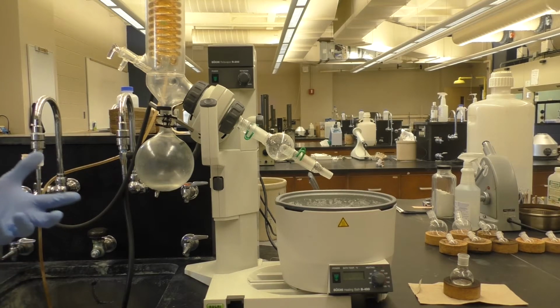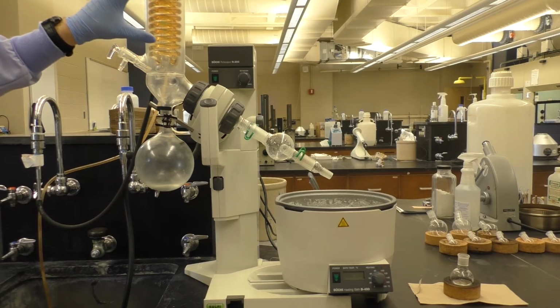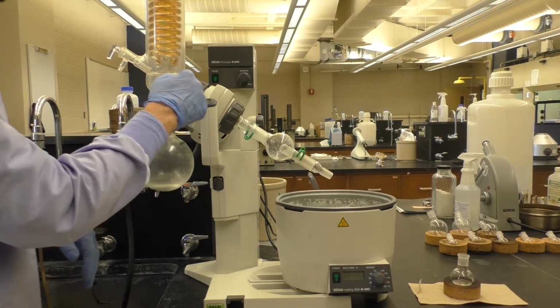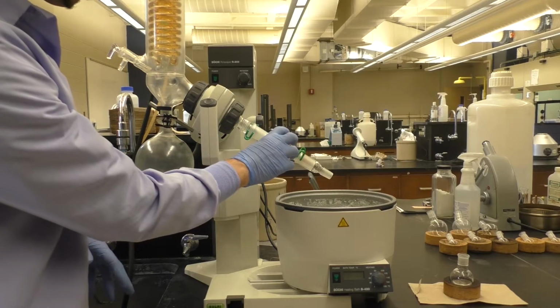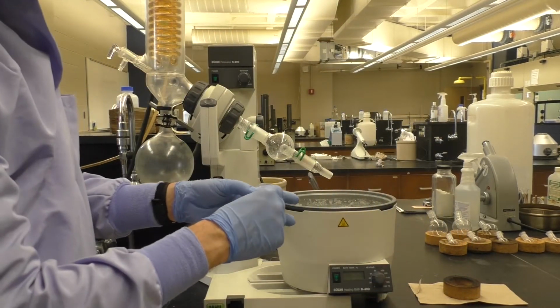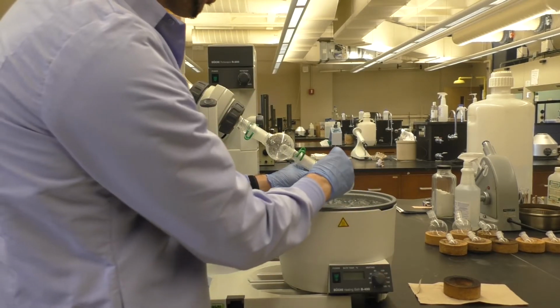And the way that this process works is that I have this connected to a water aspirator, such that when I turn the water aspirator on, it will pull a vacuum on the entire system, on this top column, on the solvent collection flask, and then, most importantly, through this center shaft here, through this bulb. Finally, it'll pull a vacuum on our actual collection flask, or our flask with material. So here I've got our material to be rotovapped, or to have the solvent removed. I'm going to connect that here and then hold it in place with a Keck clip.